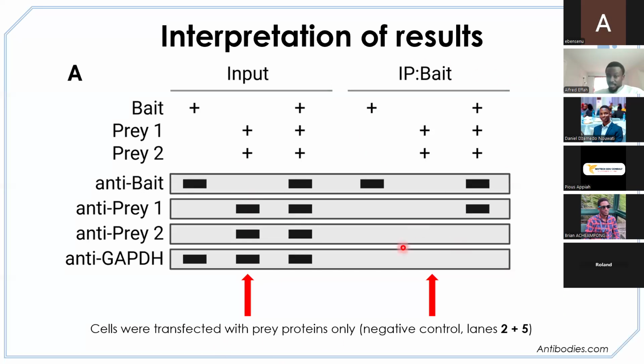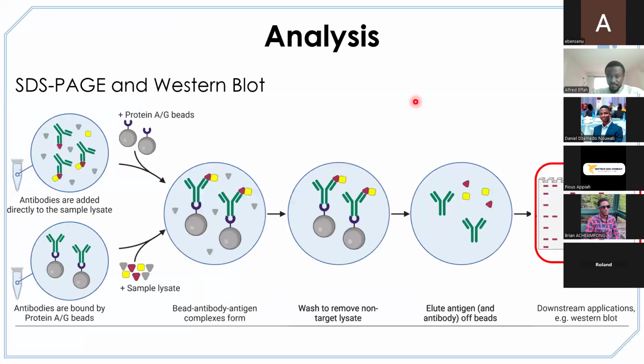Now, the same thing, like I mentioned earlier on. So here, this result, like I said, is coming from this side. What they did was that they did not express this protein in that particular sample. This protein is not present.